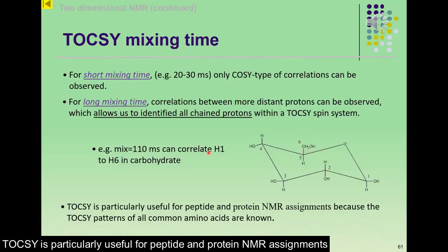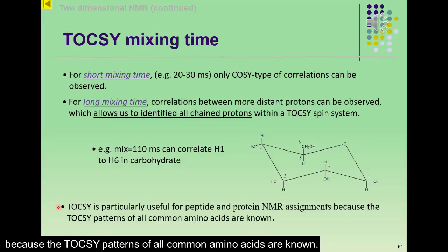TOCSY is particularly useful for peptide and protein NMR assignments because the TOCSY patterns of all common amino acids are known.